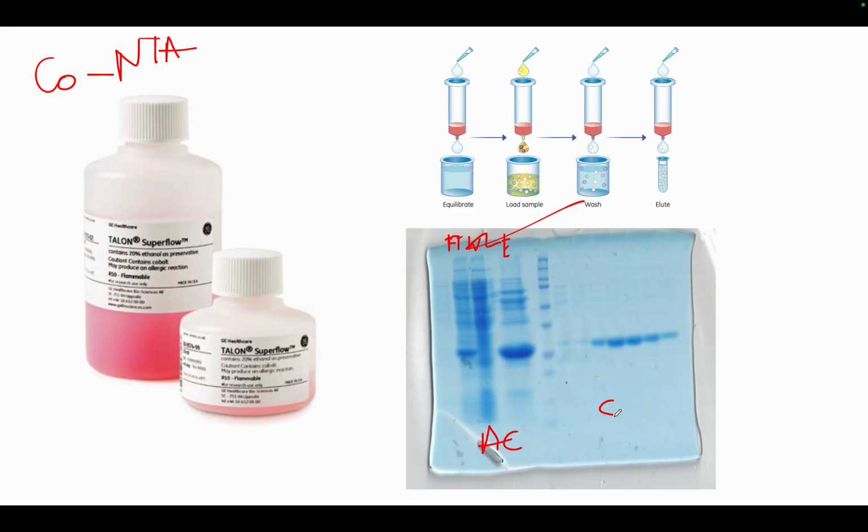On this side of the ladder, I have then used this elution fraction to do size exclusion chromatography. Okay, and you'll see that in the fractions of the size exclusion chromatography, like over here, I have a fairly thin, fairly clean protein sample here after SEC, right? So all of these contaminants have been removed through SEC. As you can see, they're in these fractions. So I will just collect these fractions and I will get a fairly pure protein sample. Okay.